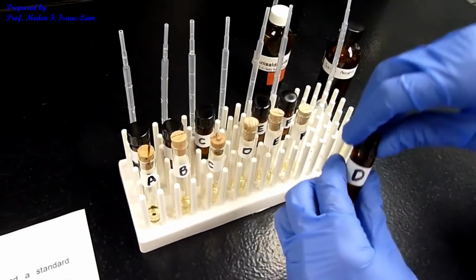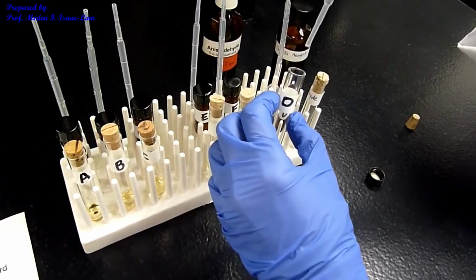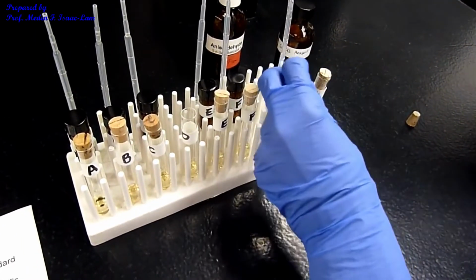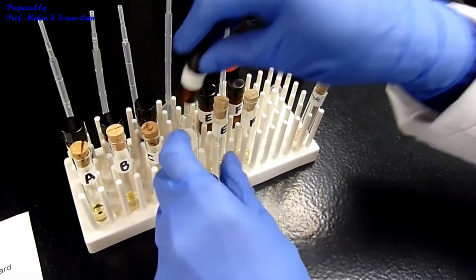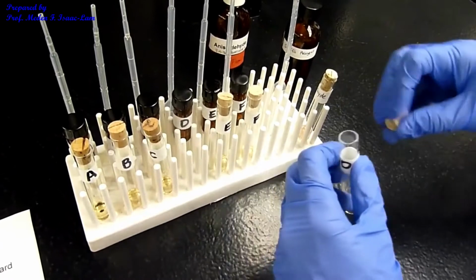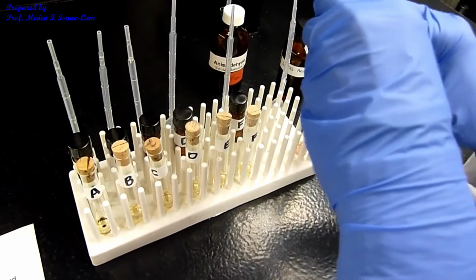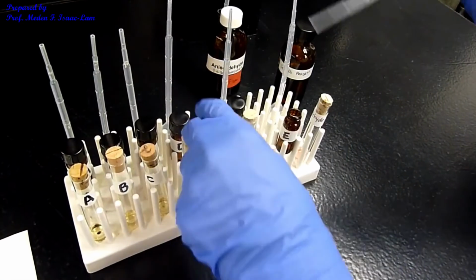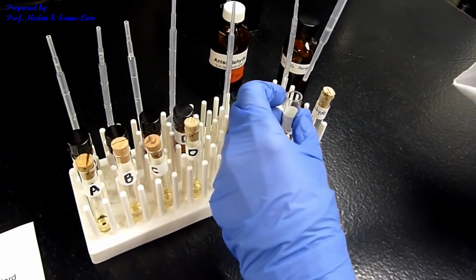So now let's go back and do unknown D. 1 drop. Shake again. Then unknown E. A drop.